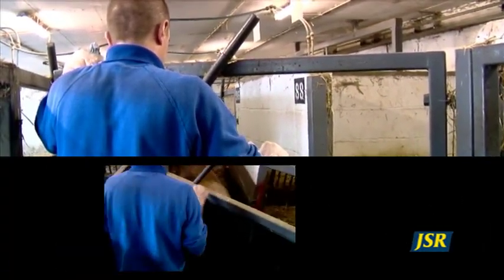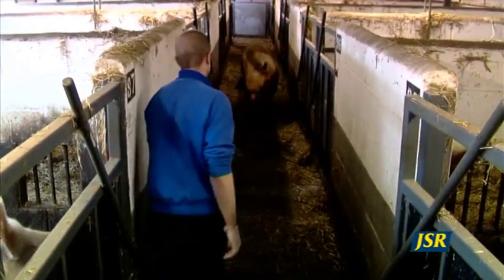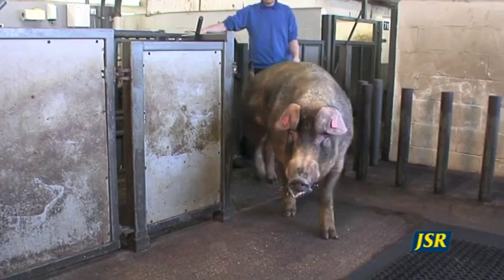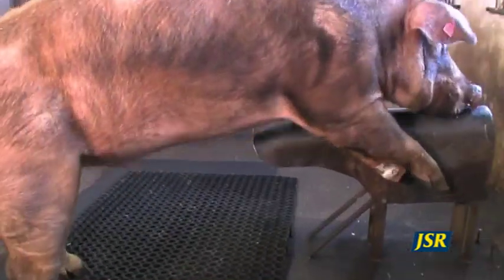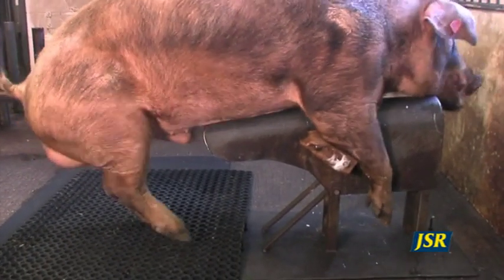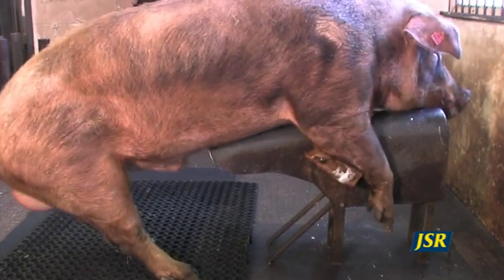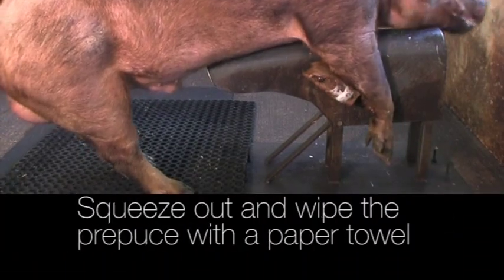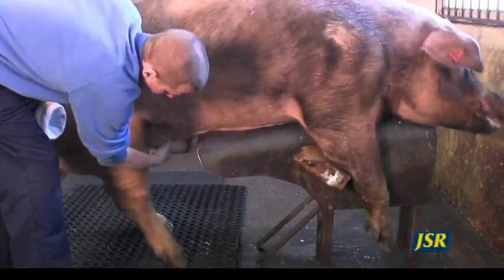Here is an example of collecting from a well-trained older boar. When a boar is familiar with the dummy, it is possible to use a separate clean area for collection, making the process simple and quick. The trained boar will mount a permanent dummy without interference and begin to thrust by himself. Enter the collection area quietly from the side. Squeeze out the prepuce to remove any urine and wipe it dry with a disposable paper towel.